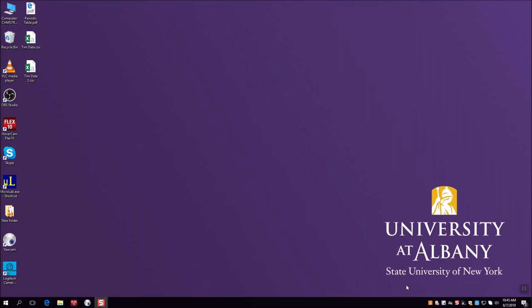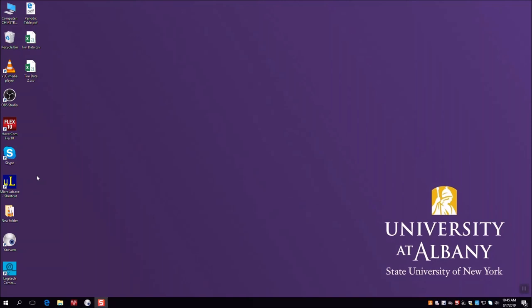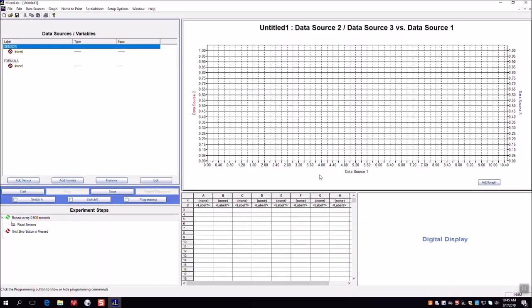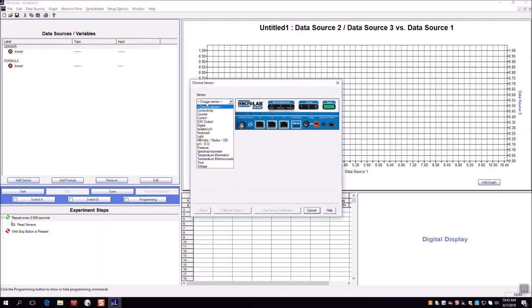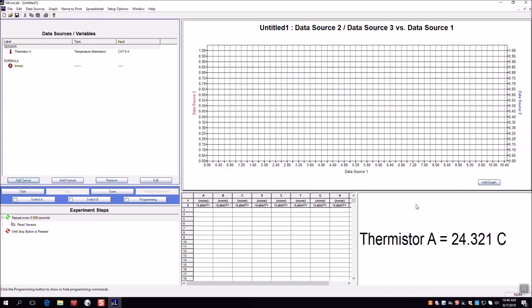The first thing we need to do is open the Microlab shortcut on our desktop. We'll see the toolbar that lets us know Microlab is working correctly. For this experiment, we need to add two sensors. The first sensor is a temperature sensor — in our labs we use a thermistor. Choose the temperature thermistor, click which input it's plugged into (input A), and select factory calibration. It's reading about 24.3–24.5 degrees in the lab right now.